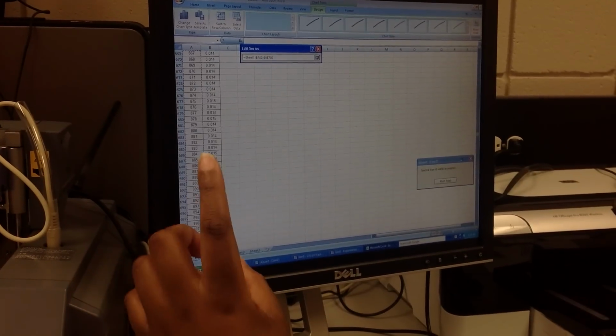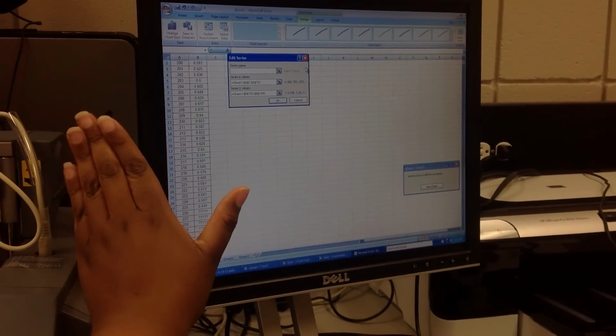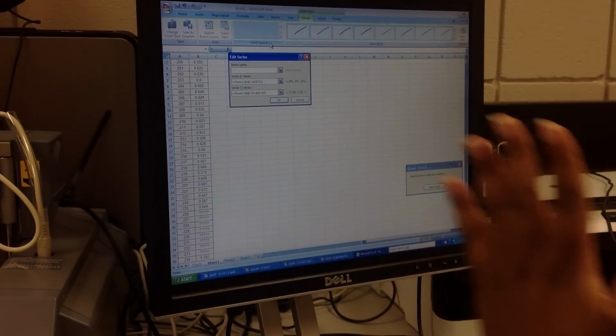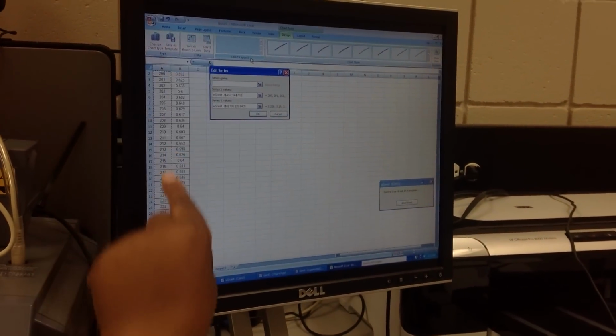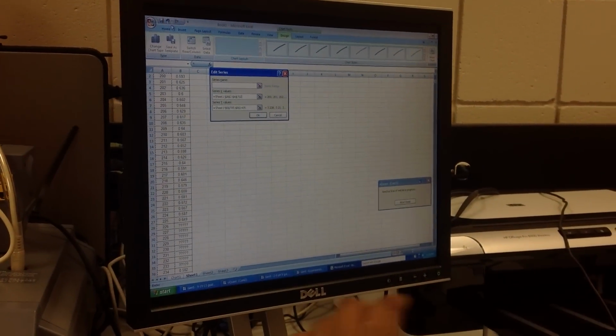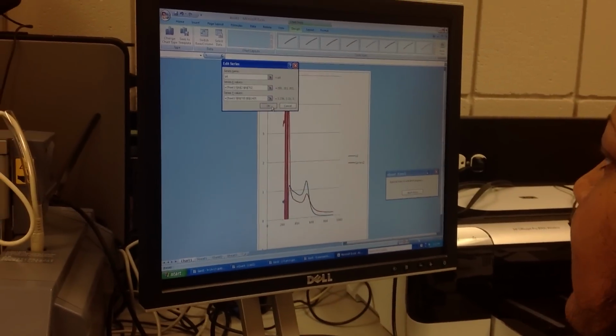Now if you're comparing two spectra that have been measured at 2 different resolutions, where one was measured every 2 nanometers, you can compare them, but you can't use the same spectrum. You have to use its own spectrum. So we're going to call this one something else. I think it was A4.